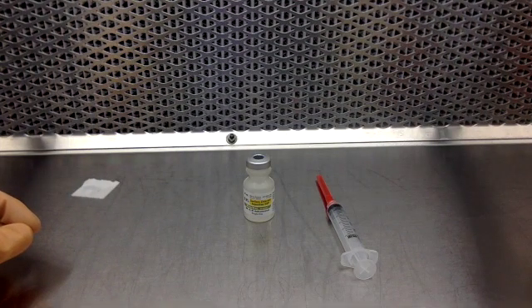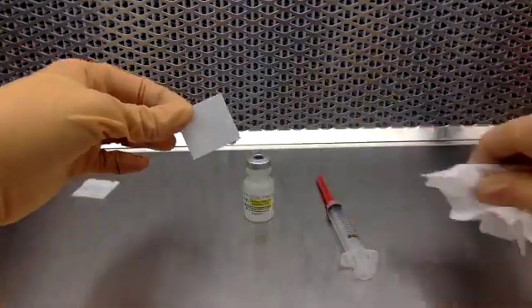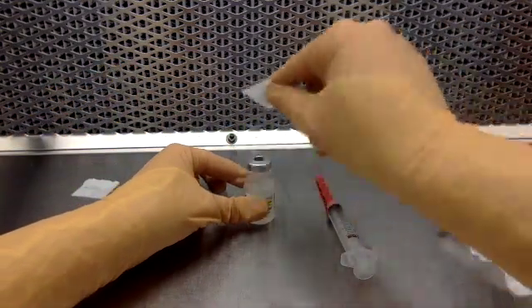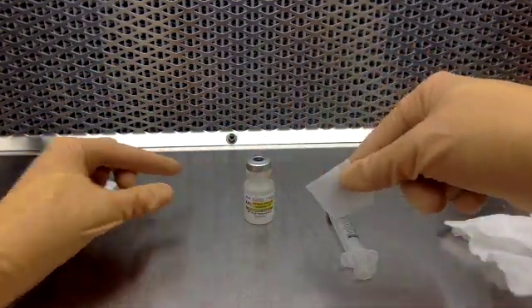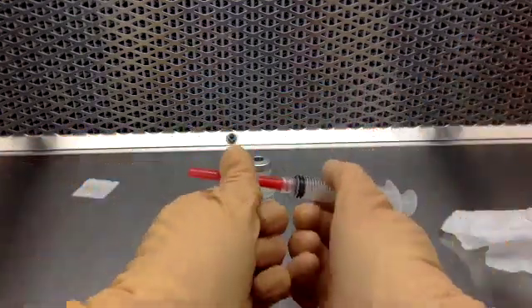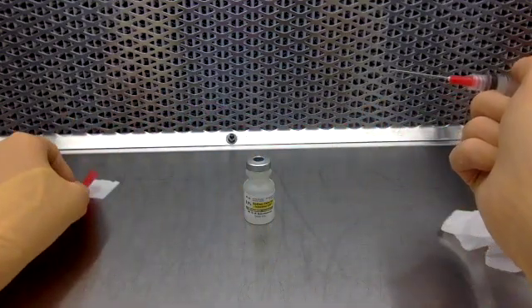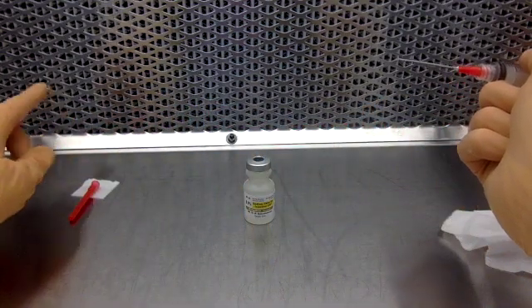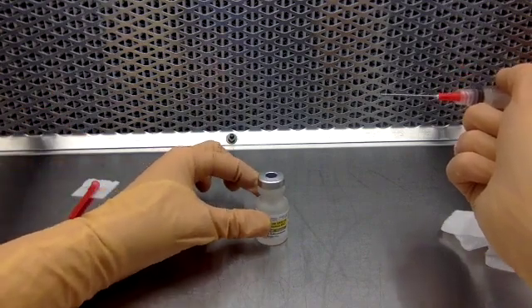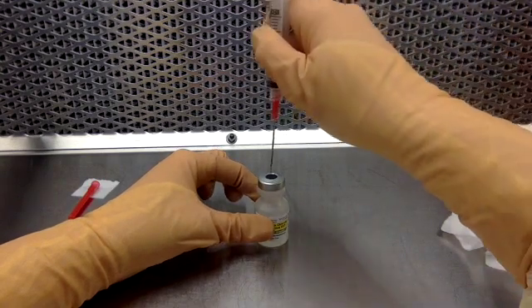Insertion using a blunt fill needle. Firmly disinfect your rubber septum 3 times in the direction of the airflow. Safely uncap. The cap must always be on that alcohol swab facing the HEPA filter. You're going to support your vial and at a 90 degree angle, go straight in.